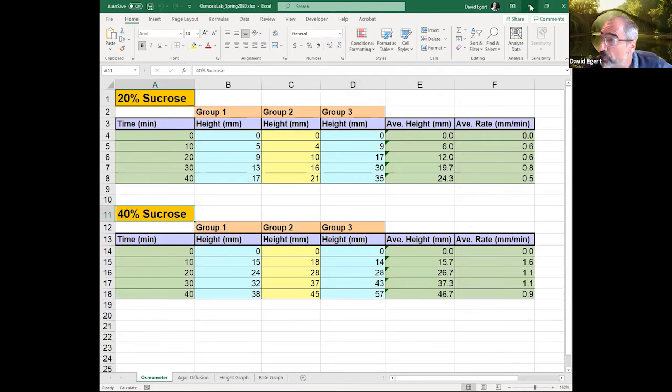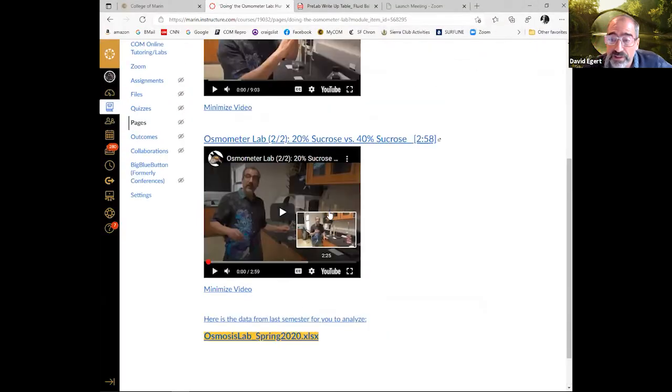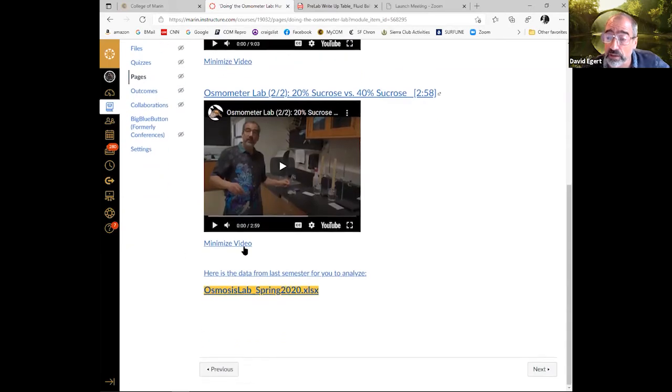So that's the first part here. All you're going to do for the Osmometer Lab stuff is look at these things. It's going to be like 11 minutes worth of videos to see what you're doing. And then you've just got the data, and then you have to decide what does it all mean and write up your discussion on it.